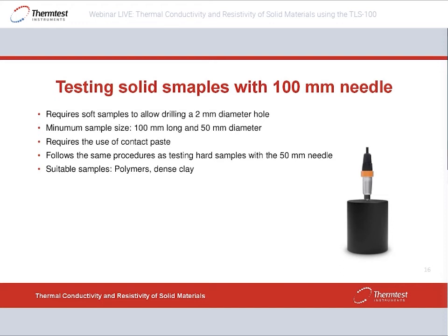Suitable samples for this can be polymers. I've seen it used for dense clays, where you cannot really push the needle in. You have to drill first. Then it works nicely with a 100mm needle, because the sample will give to the drill bit without heating up too much and breaking the needle. Oh, sorry, the drill bit. So it's a limited type of material with this use, but it works nicely where you can make this 2 millimeter hole.